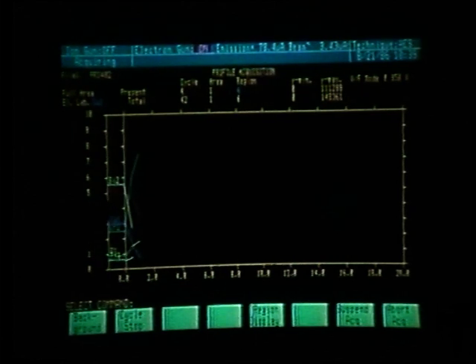What we see is carbon was on the surface, and as we have now sputtered 2 cycles, which would be a total of 1 minute, we see carbon decreasing. Silicon was also a surface contaminant. That is decreasing. Copper was at this point only on the surface. We know it's the substrate, but we did have some on the surface that is decreasing.